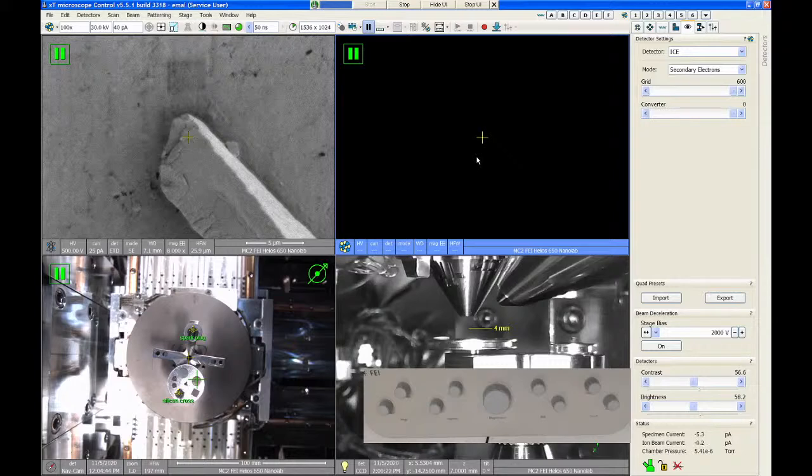Okay, cool. Now that doesn't work really well if you're going to do tomography. You really can't use that option, because it'd be too tedious to coat the sample after every FIB slice. Right. But for just single view type cross sections, that works really well. Okay, thanks.